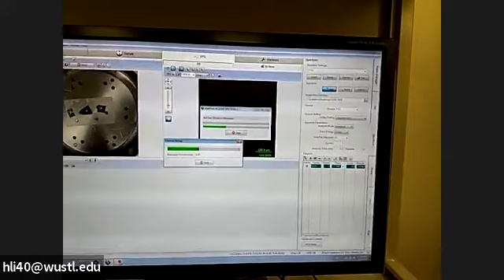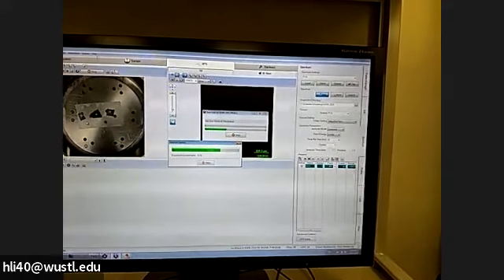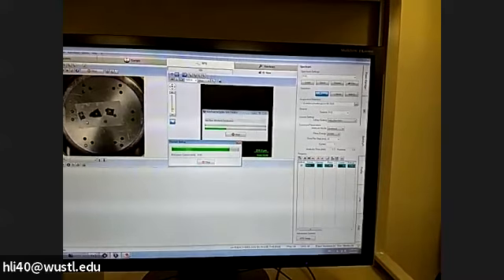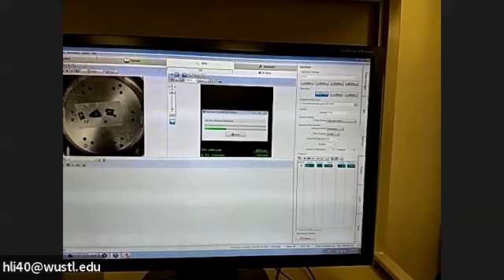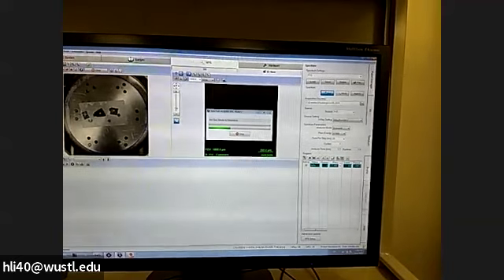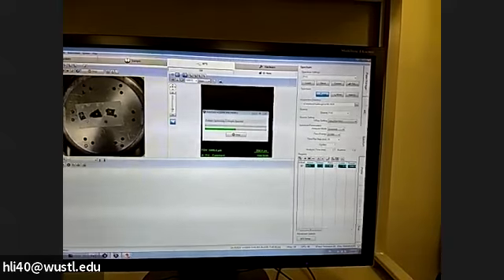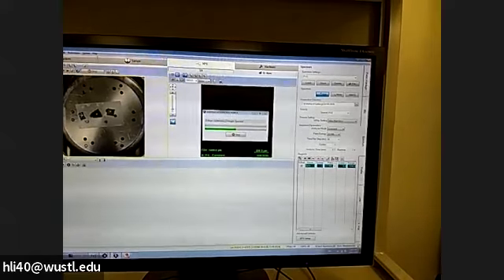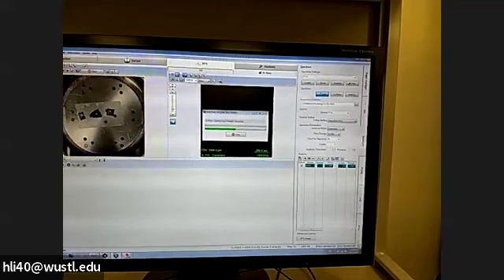Okay, you see the E neutral is on, argon is on. So now we will do the scanning for you. We watch for a minute, then we pause the recording, and then we take another recording to set the file range, which takes another 10 to 15 minutes.